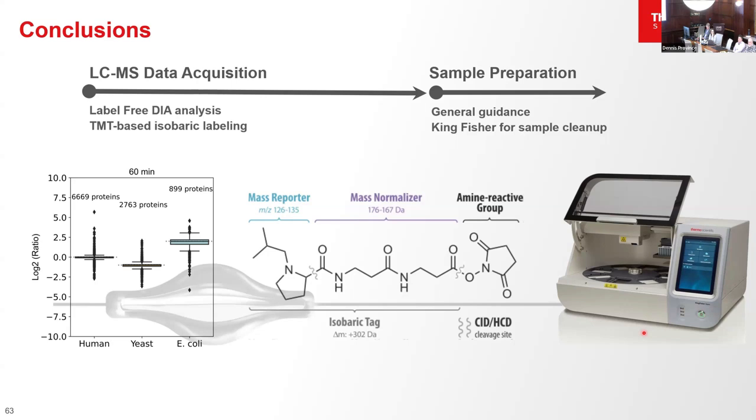And so it's kind of like a Western, right? We get this asked a lot, and I'm surprised it hasn't come up today: what's more sensitive, a Western blot or the mass spectrometer? Yes is the answer, right? Whichever one you want. If you have a great antibody, it's going to be better than a mass spectrometer because it's going to be as sensitive and more selective.